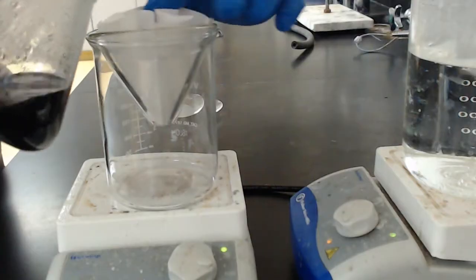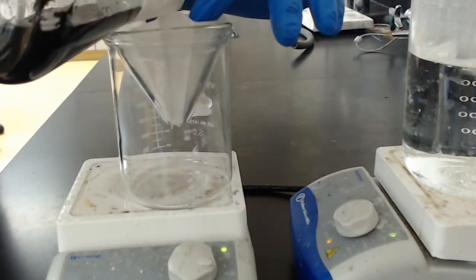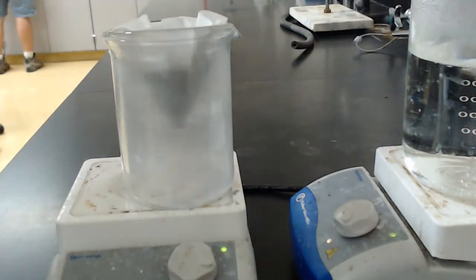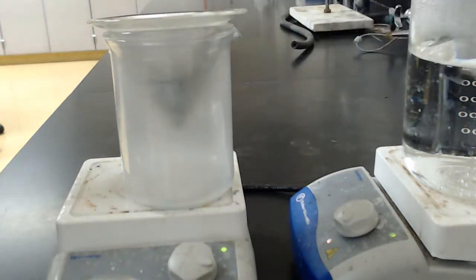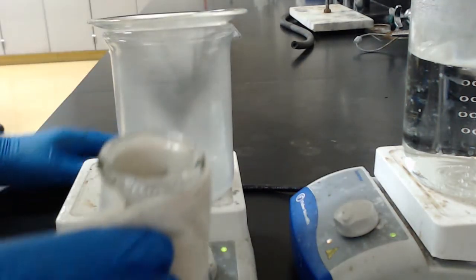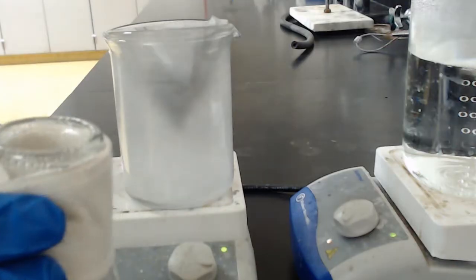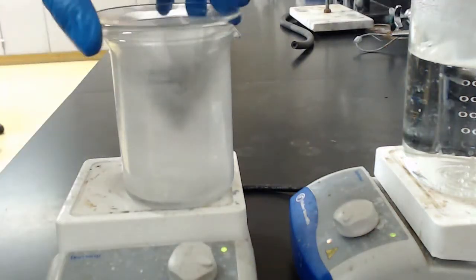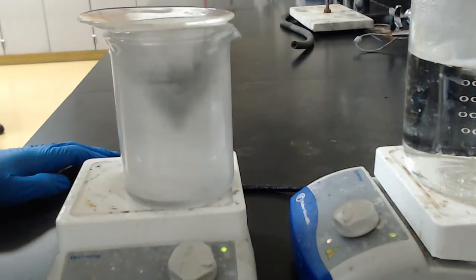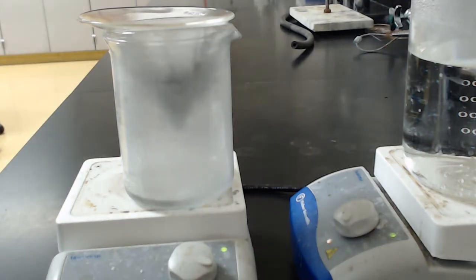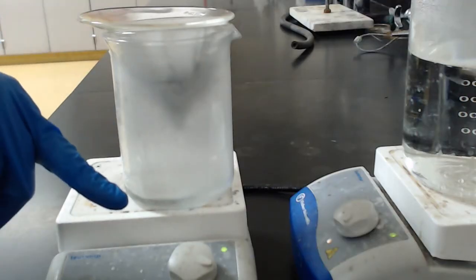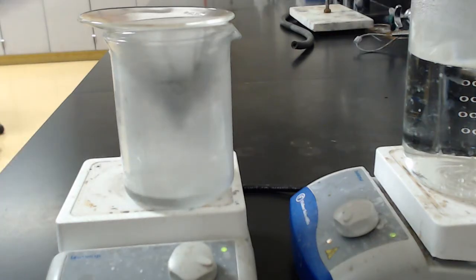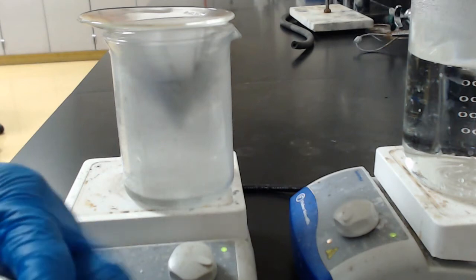So pour it in. And try not to burn yourself. And then I have the watch glass to keep everything hot in there. Because you want to try to avoid getting any acetanilide crystals inside of the funnel, which is going to be an issue, but we can use the hot water to help with that. I'm not sure if you're seeing it well on the camera, but we should have completely clear and colorless water coming through. You shouldn't have any brown. We got rid of that with the charcoal and we should be getting rid of the charcoal with the filter.